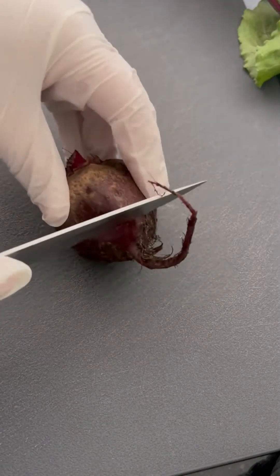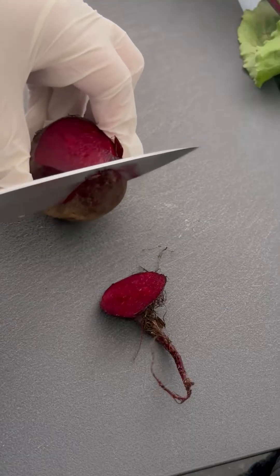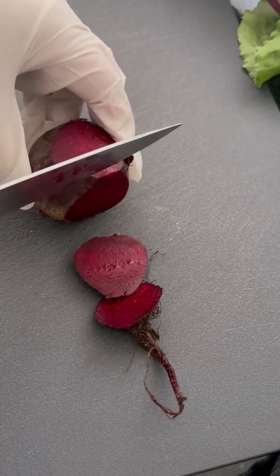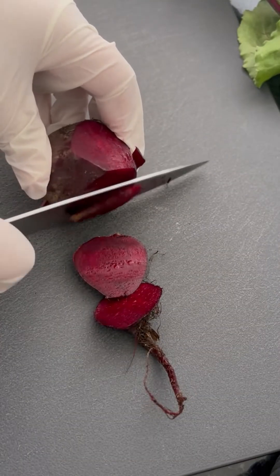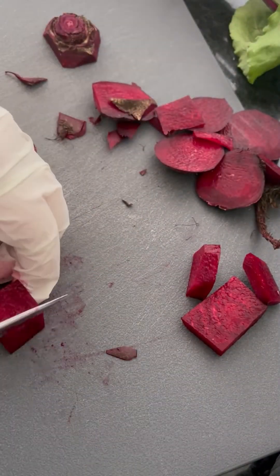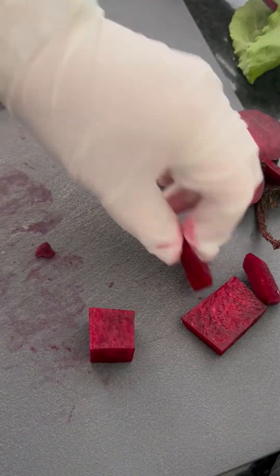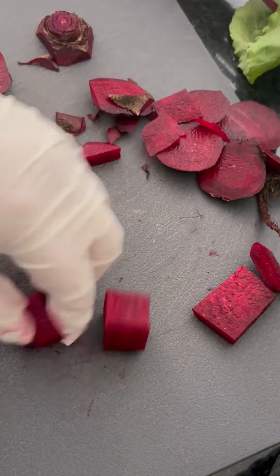Let's start by cutting a beet into two different sized cubes. We use a fresh beet here, not a canned one. We're going to make one cube about two centimeters on each side and one cube about one centimeter on each side.